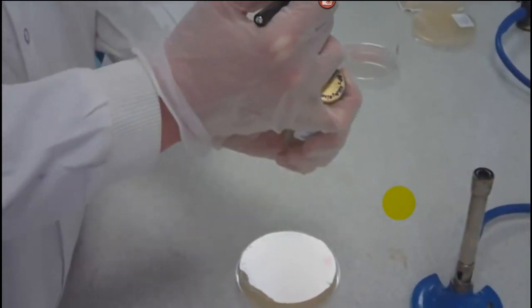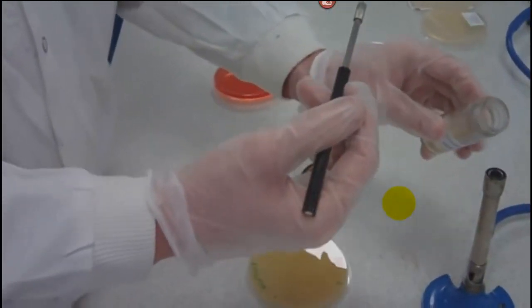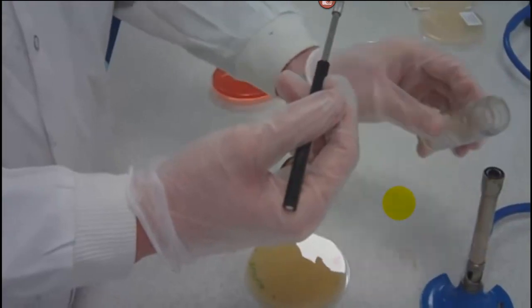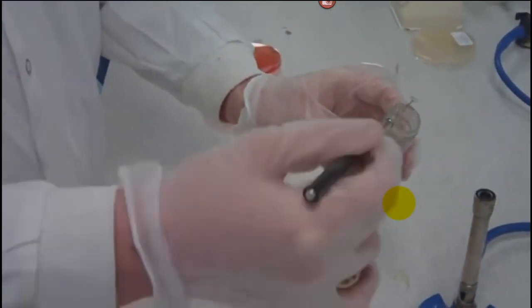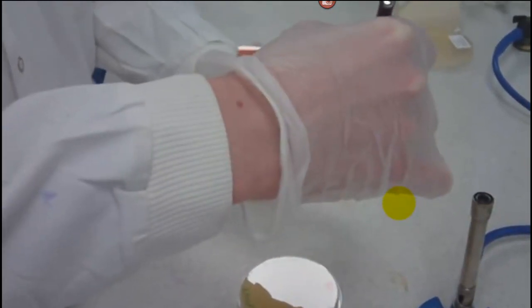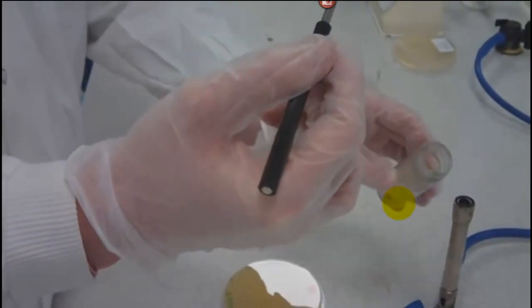Yeah, little pinky finger is going to twist the cap off. Going to heat the barrel. You want to kill any contaminants that are there, keeping them from escaping. Now he's taking some out carefully. He's going to heat the barrel again.